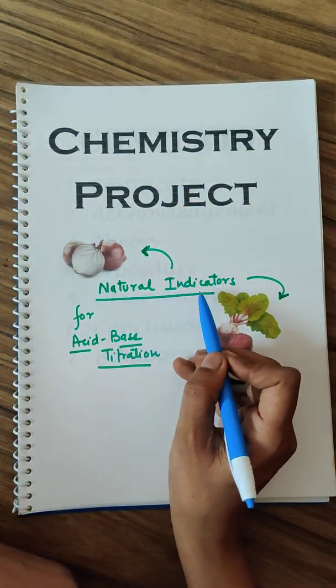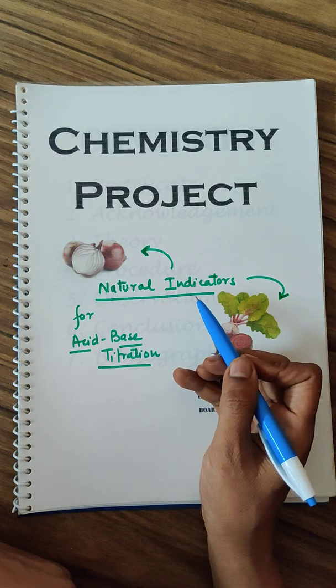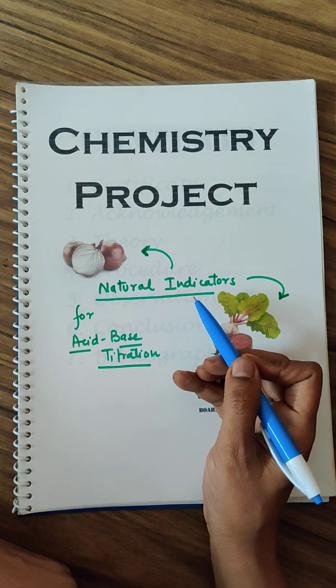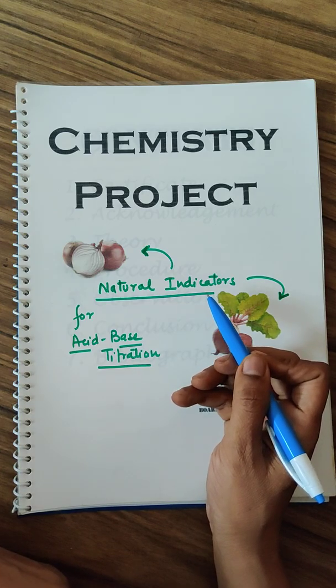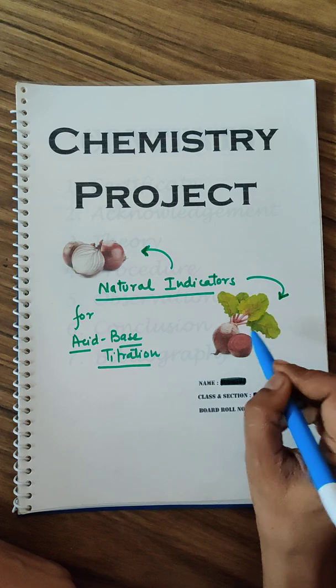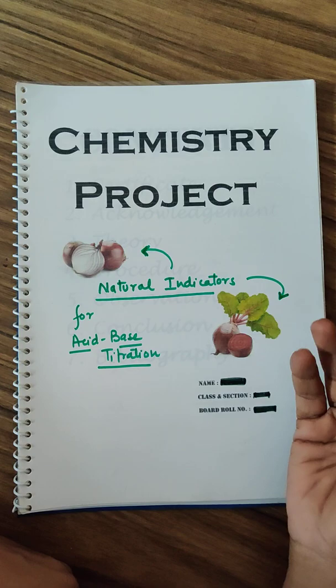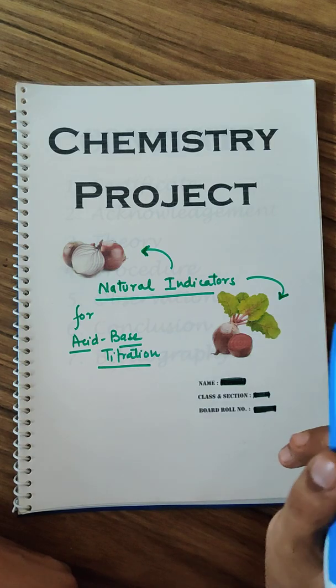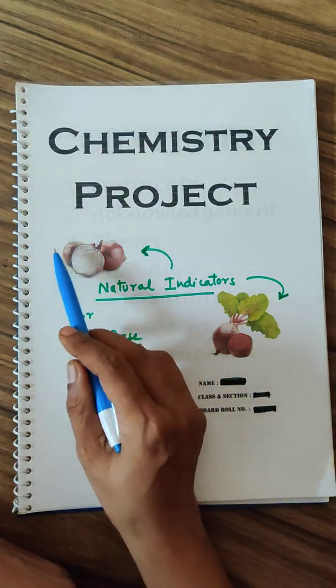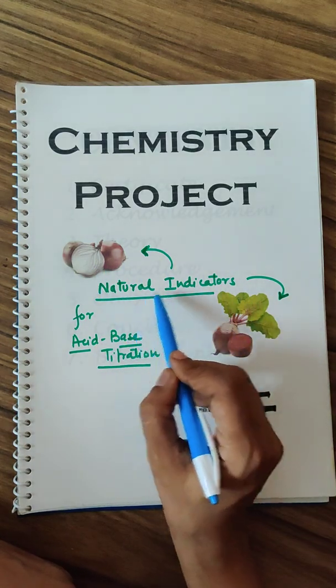This one is a chemistry project on natural indicators. Now there are many things which can act as natural indicators - there are flowers like marigold, petunia, rose. You also have onion peels which can act as indicators, beetroot which can also act as indicator, and red cabbage. You can use any one of these.